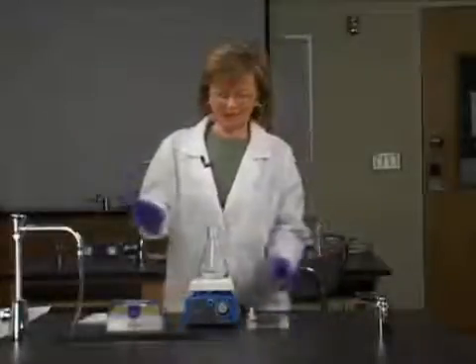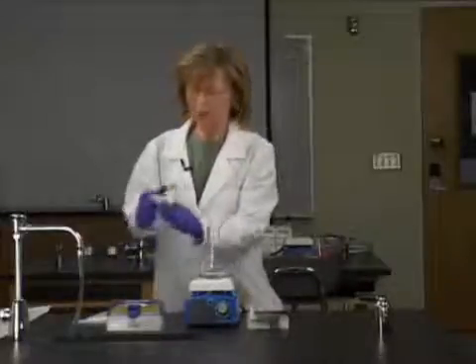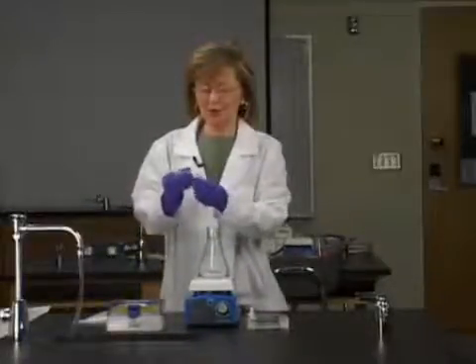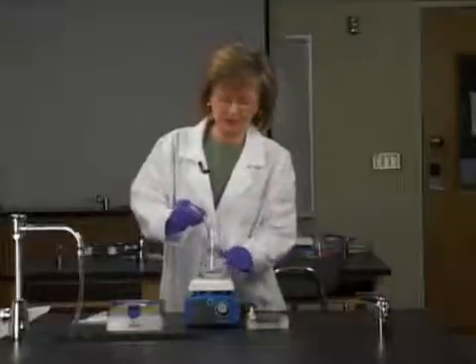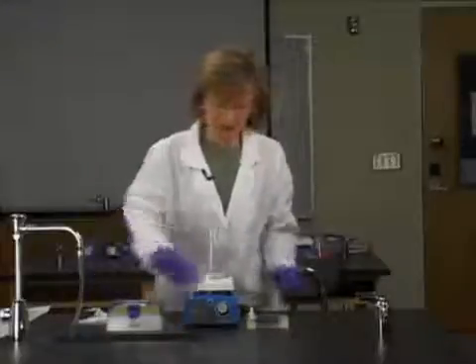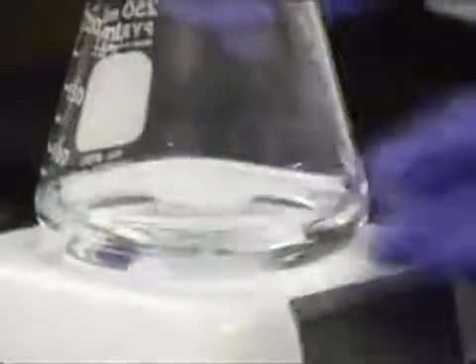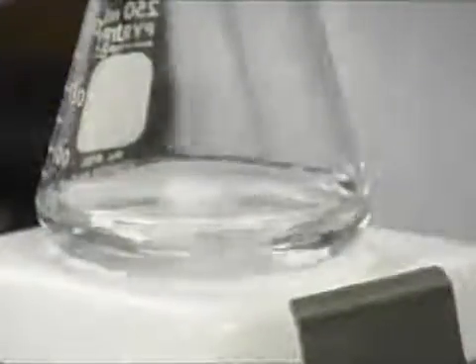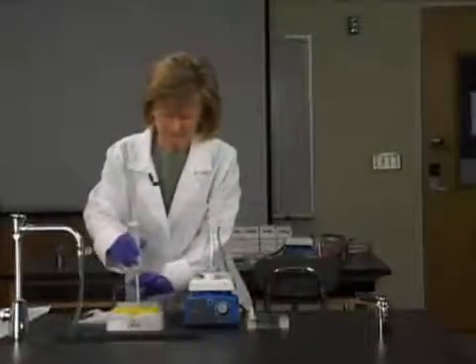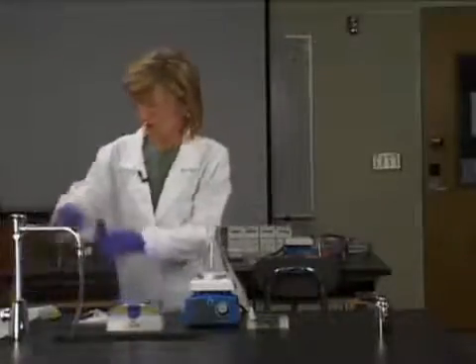Okay, so we've melted the agarose in the microwave, let it come to a boil, and now we're going to let it cool down. We're going to put a magnetic stir bar that's been sterilized into this flask, and then we're going to turn the stir plate onto its lowest setting, and it takes 2 or 3 minutes for that to cool down. And while it's cooling down, we're going to set the pipette.